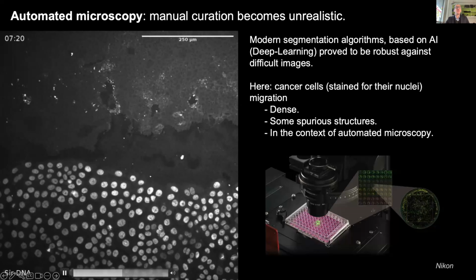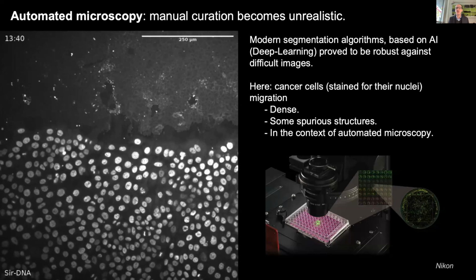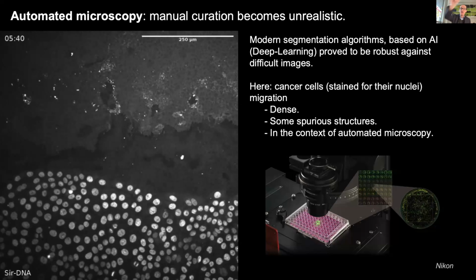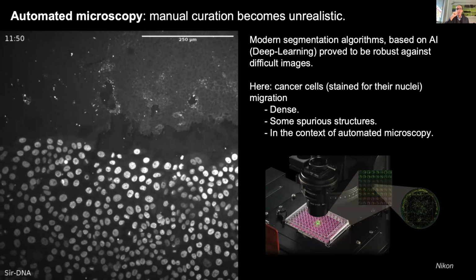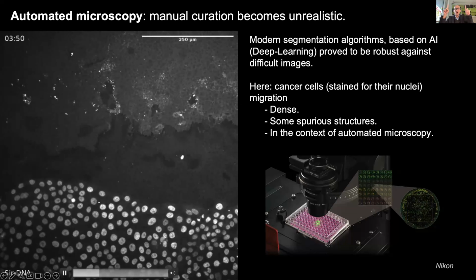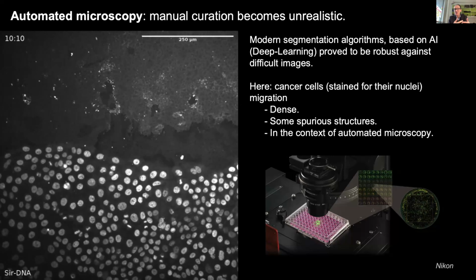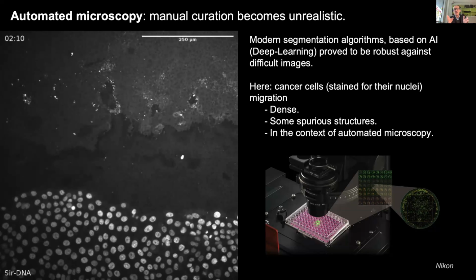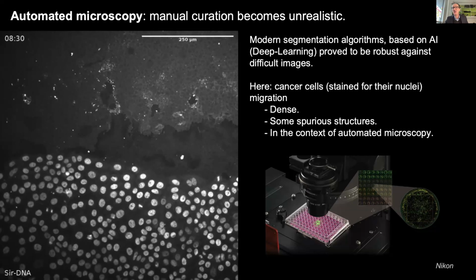I will take now the example of what you see here. It's cancer cells in a wound healing or cell migration assay. My collaborator, Guillaume Jacquemet, at Turku University, cultivates cancer cells and then you remove automatically a wide chunk of the cells, and then you will see that they migrate north, colonizing the space, right? And this is linked, of course, cell migration to cancer aggressiveness. And Guillaume is actually testing different drugs that affect this process. But he does it in an automated manner.